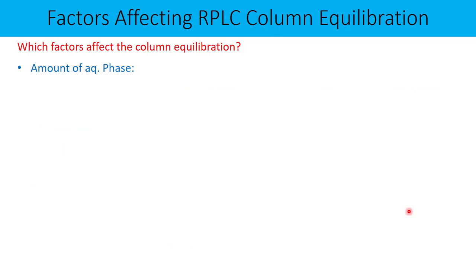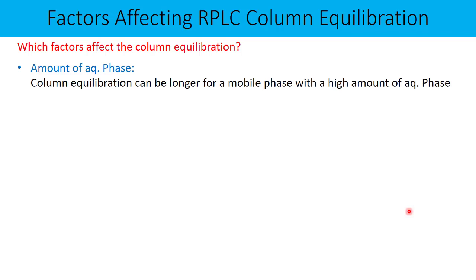The amount of aqueous phase in the mobile phase also matters. Column equilibration can be longer for a mobile phase with a high amount of aqueous phase. In reverse phase liquid chromatography, our column is hydrophobic, so if the mobile phase contains more aqueous phase, which is polar in nature, the stationary phase actually repels water out of its pores. The more the amount of water, the more the repulsion, the less the wetting process. To wet the entire stationary phase, you may have to equilibrate the column for a longer time. This is the drawback of high aqueous mobile phases.